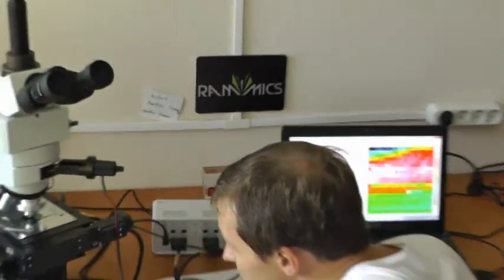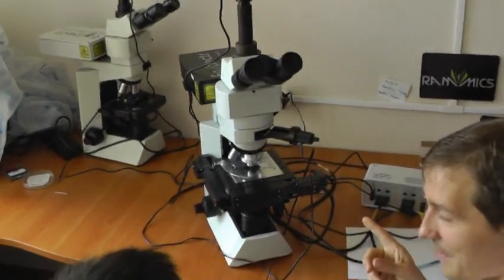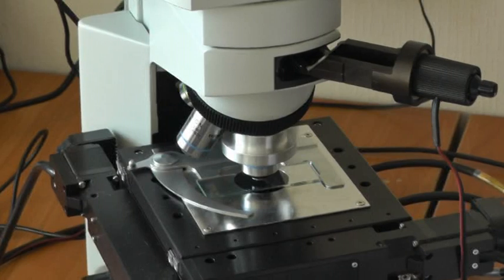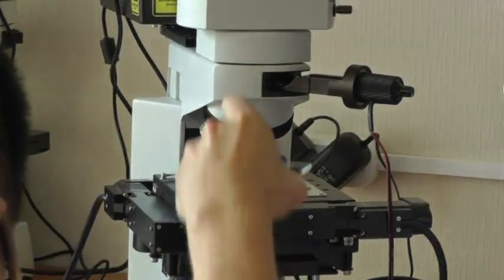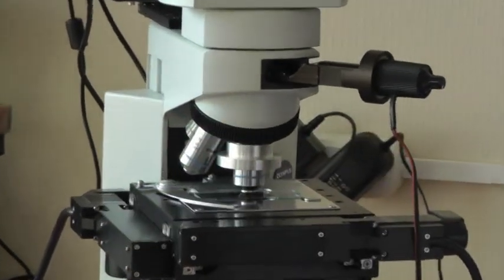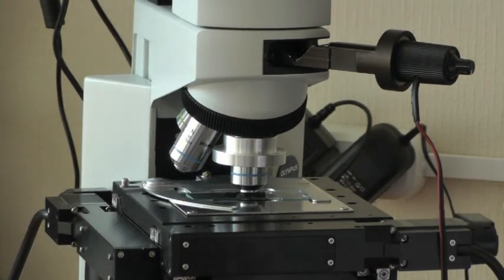To show this on the microscope, although it is not the cheapest system, it is more convenient for us to explore and to visualize. What microscopes can it be adjusted to? Any microscopes, any commercial microscopes.